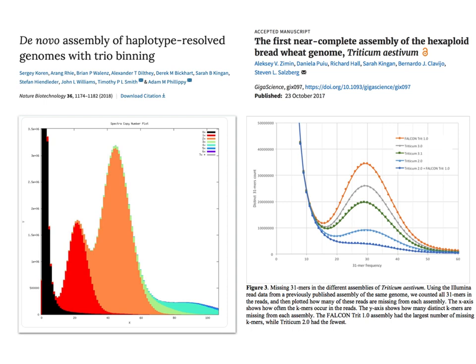So the lowest line is a distribution that has been computed by basically putting all of the assemblies together and then checking which k-mers from the original Illumina reads were not included in the assembly at all. So those are k-mer content that no combination of sequencing technologies and assembly algorithms shown in that paper recover from that dataset. So these are two really nice papers that do take into account content recovery, so if you have not read them, you really should.